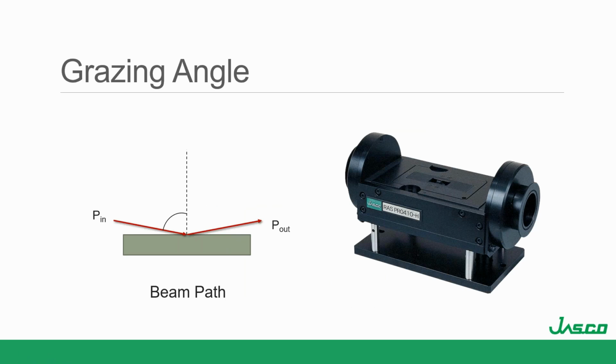And so grazing angle is very close to specular reflectance, only it's got an 80 degree and higher incidence angle. So it has a really shallow angle of entry. And you can imagine this will actually interrogate more because you're looking at a more shallow base. So you're looking at more of the sample on the surface. This is really good for extremely thin films. It's usually low concentrations, we're talking monolayers to multilayers. And a lot of times you have to use MCT in conjunction with it.